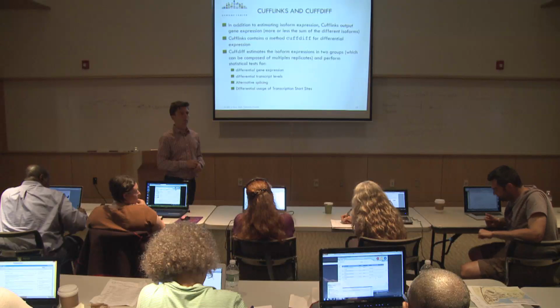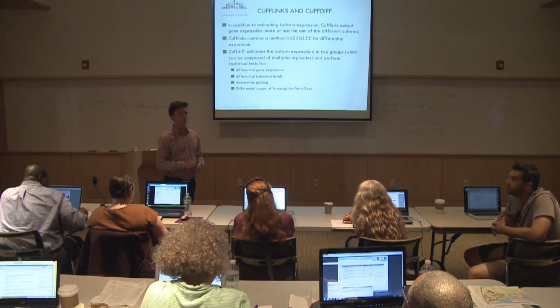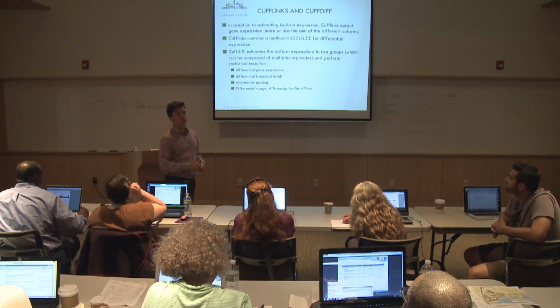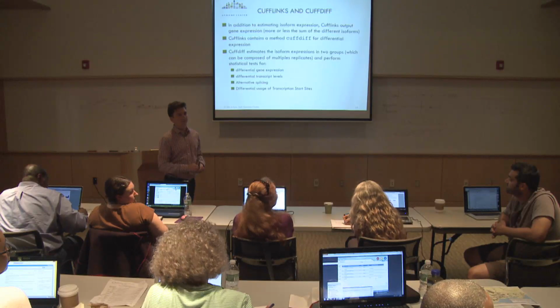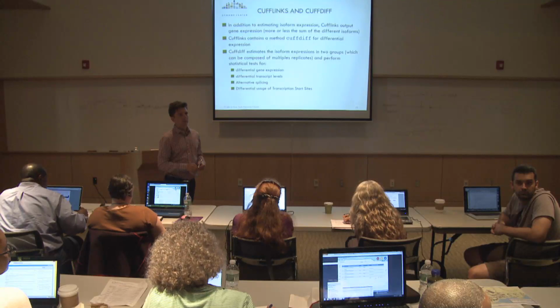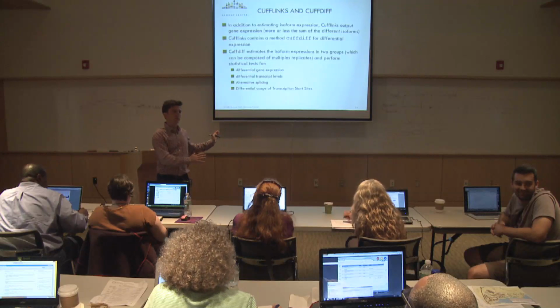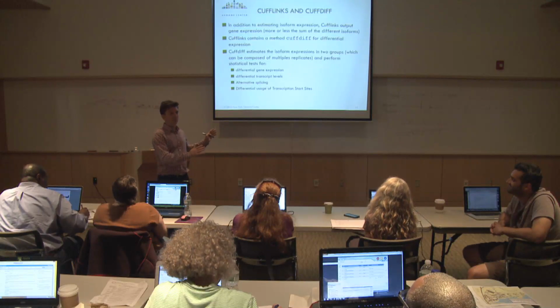So, I mean, I've been thinking ahead to the pedagogy. I would lose students going through this quantitation step. Yeah. I think I don't want to shirk responsibilities in trying to convey the nuts and bolts of an RNA-Seq experiment. So, I mean, here is the Cuffdiff proposition. Yeah. I actually don't use it, to be very honest.